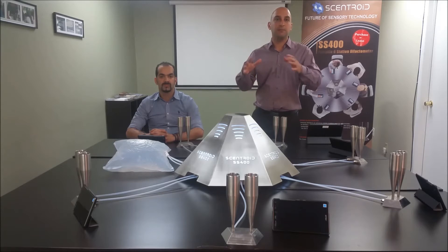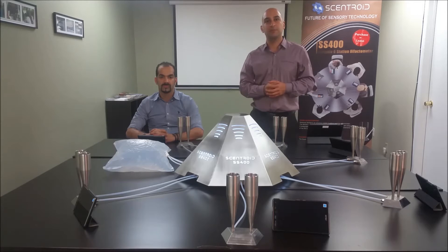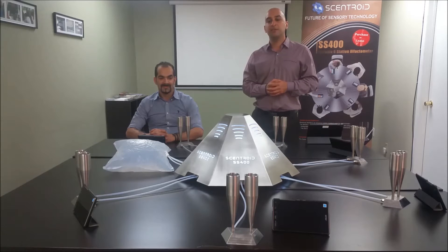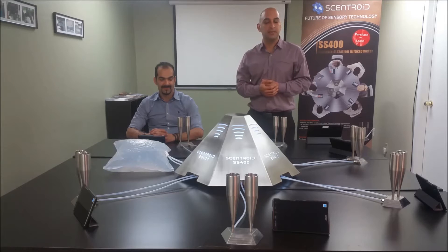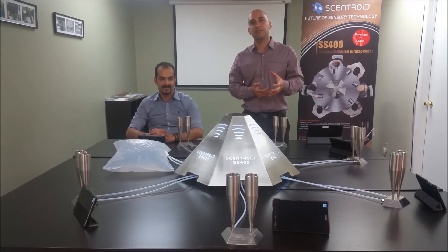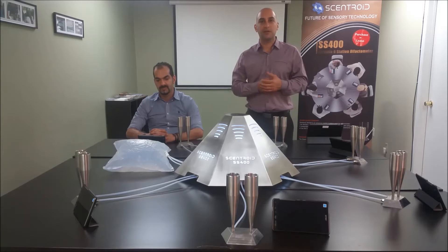But it doesn't need to take a permanent location at your office. It can be packed away, put into a suitcase — it has its own special Pelican case — and it can be used to travel to a remote location and set up a lab there as well. We're going to go over some of the features of this instrument and some of the unique offers we are extending to you.